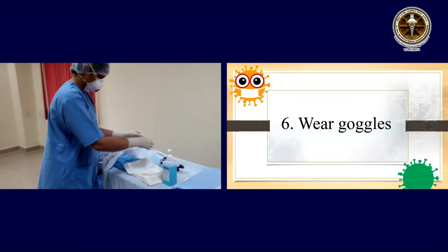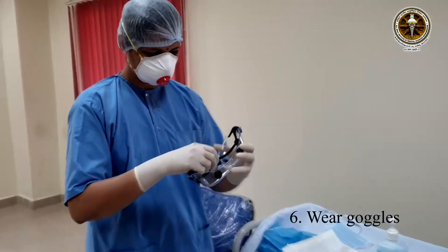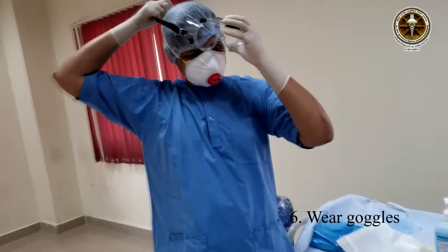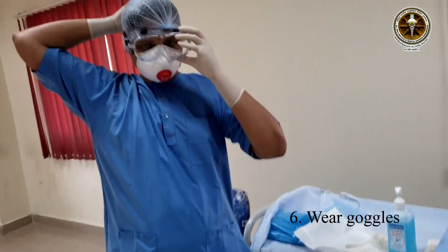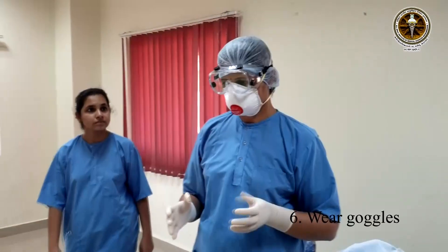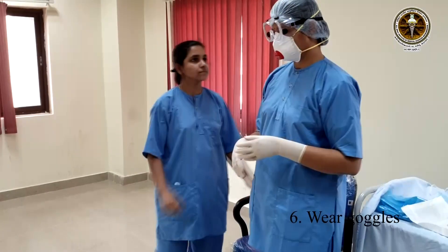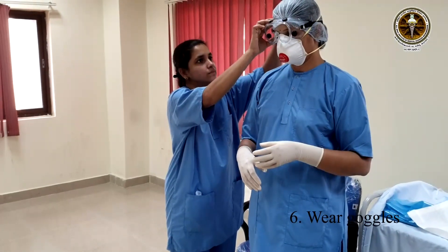Wear protective goggles. The buddy can inspect for proper fit of the goggles. If the person wears spectacles, the goggles should completely cover the spectacles.